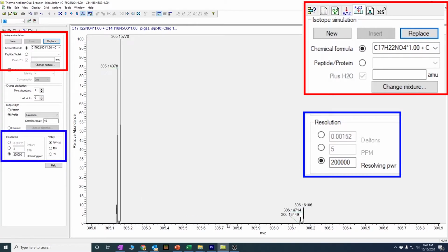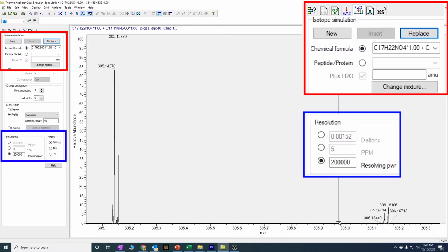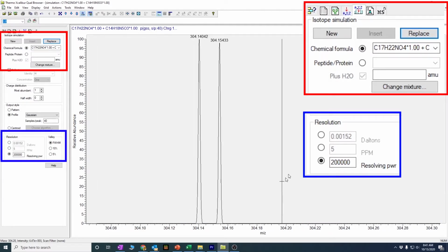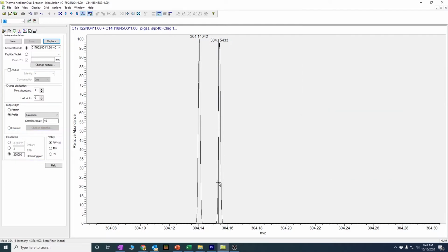There we go. And we can see we've got peaks here. There we go. Okay, it gets a little bit messy. Okay, so we had these isobars that were pretty close to each other in mass, but as we increased the resolution, we were actually able to distinguish the isobars. So in this case, if we had a mixture of cocaine and that antibacterial, that quinolone compound, we could see them as two separate peaks. So high resolution gets you that.